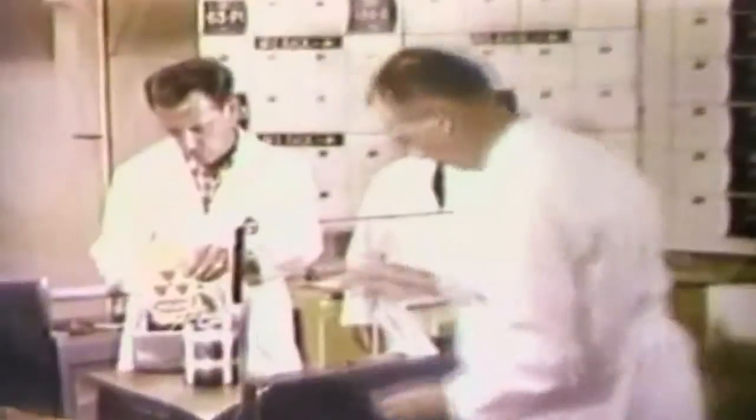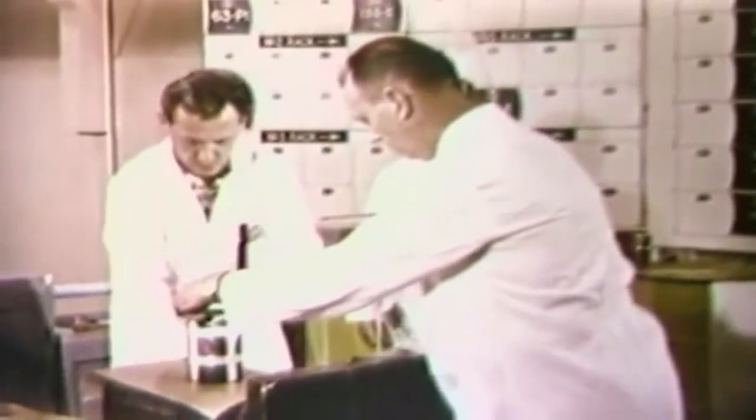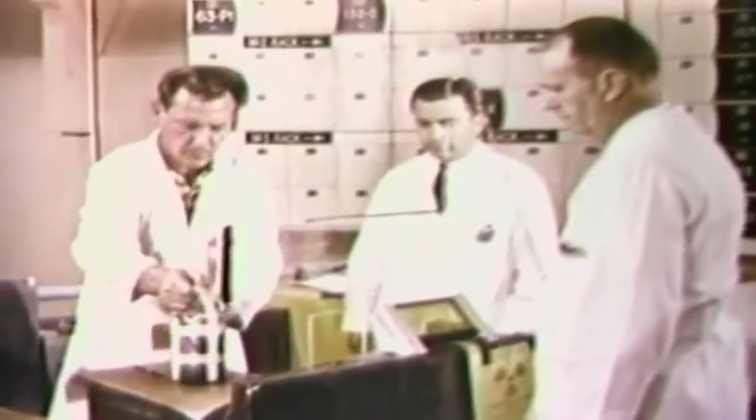It is emptied of the bone sample and the arsenic standard, each still sealed in its polyethylene tube. Again, the samples are monitored for radioactivity and then placed in the lead container. Before the lead container can be transported back to the FBI laboratory, it must bear a radioactive material label which states the radiation intensity at its surface.